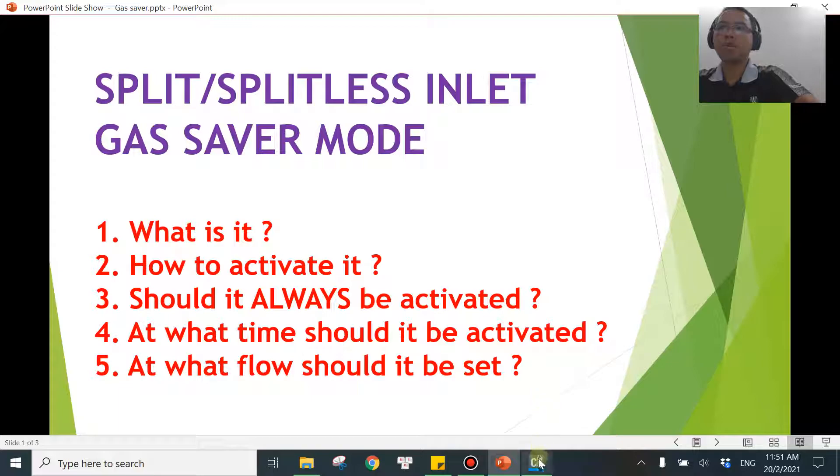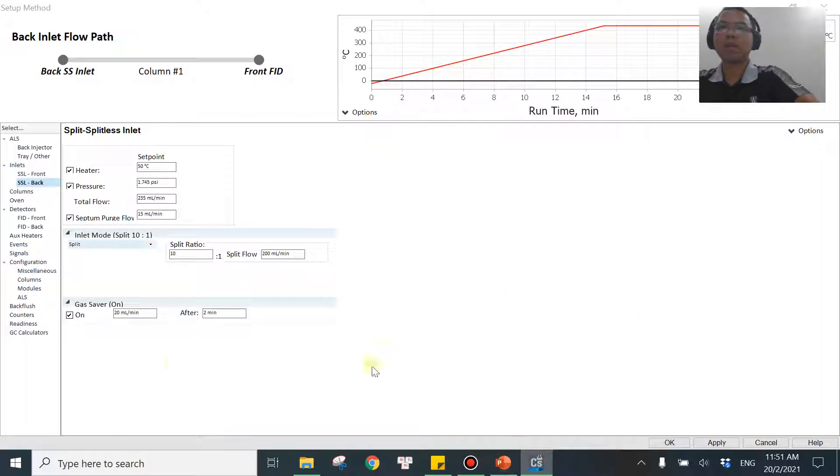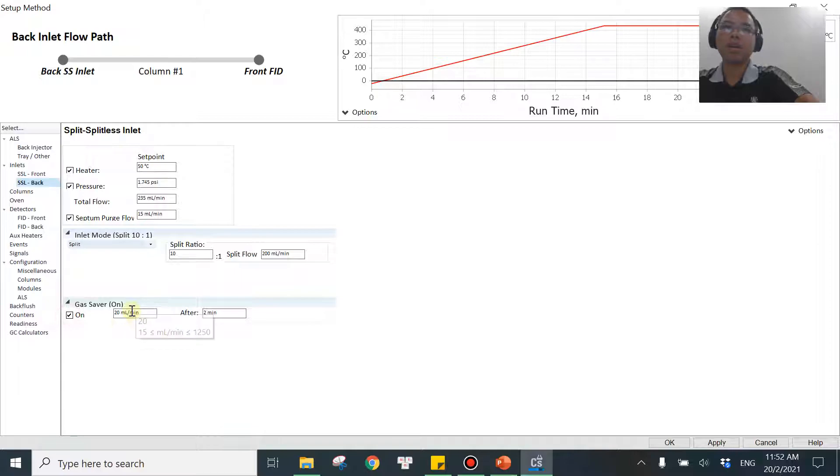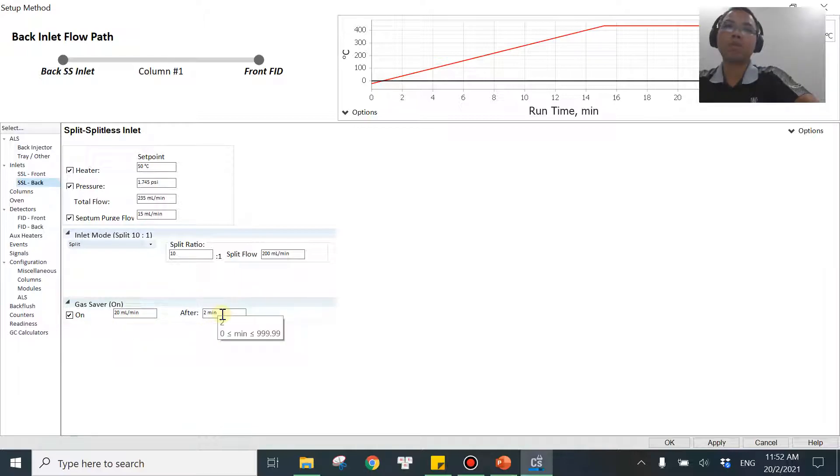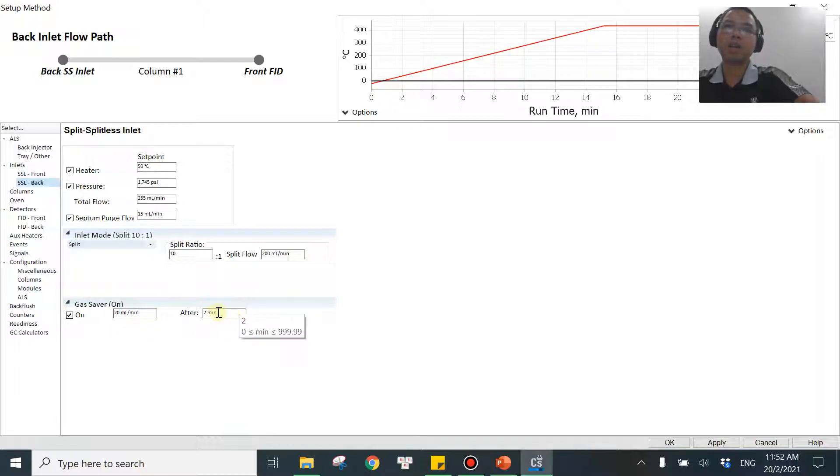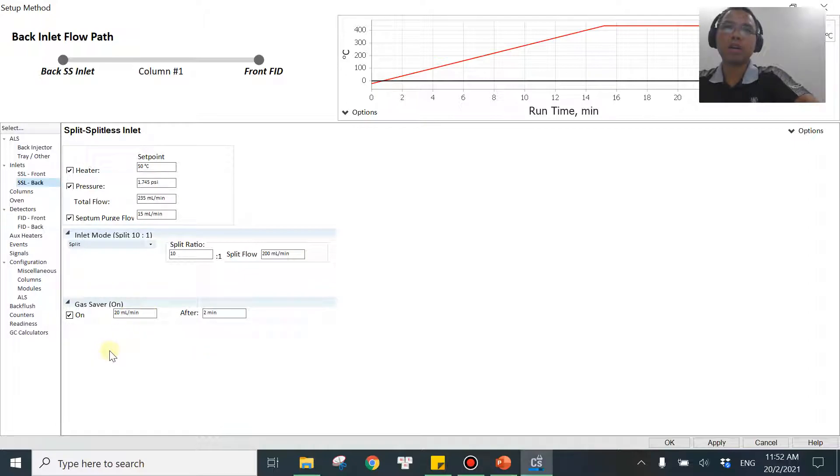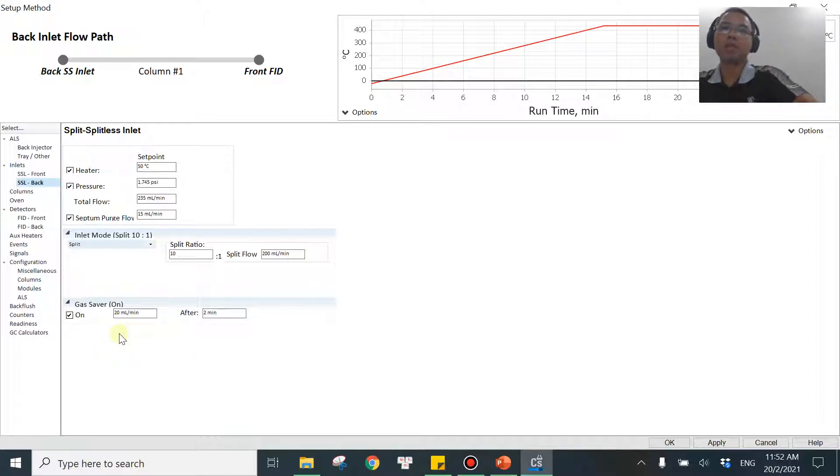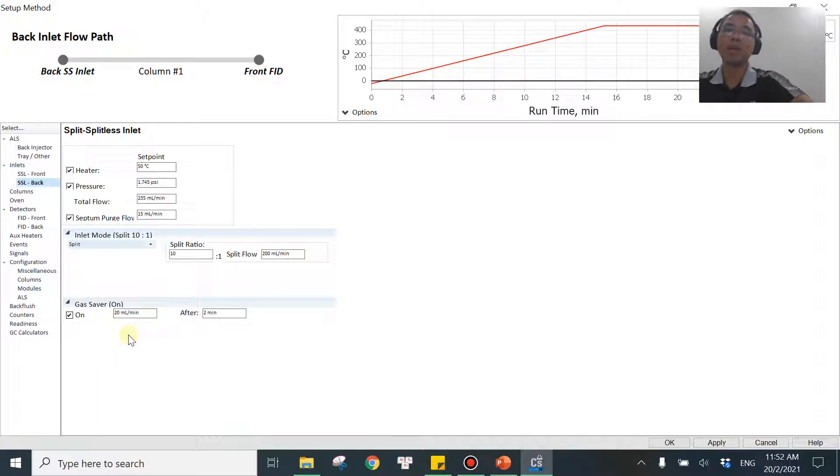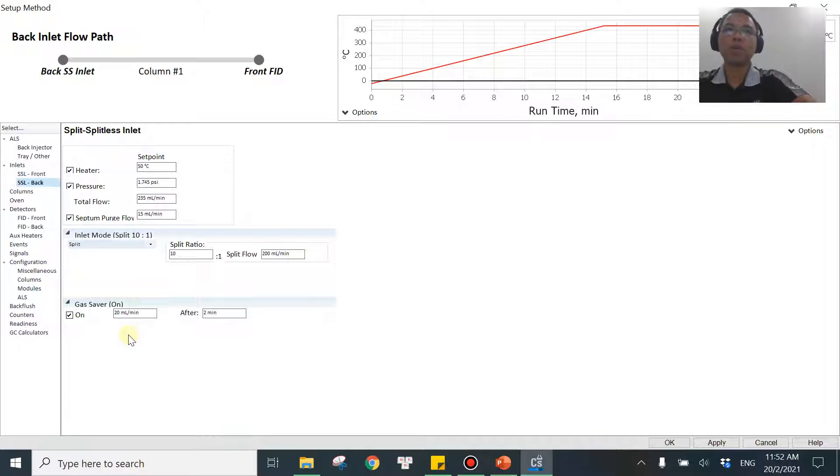So if you are using the gas saver mode, if you activate it, you look at here. Whenever you turn on the gas saver mode, the software will automatically define 2 minutes for you over here and 20 mL per minute over here. In the last video, I was explaining what time you should be using. But in this video, I will be answering the question: what flow rate should we be using? By default, it will be set at 20 mL per minute.